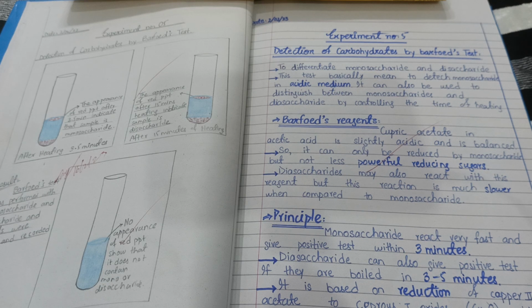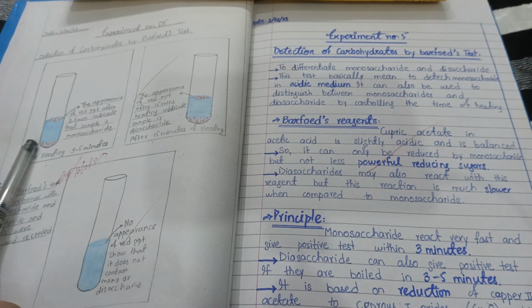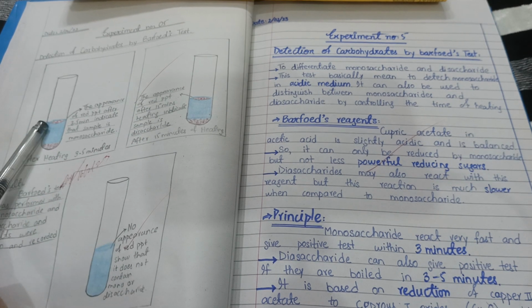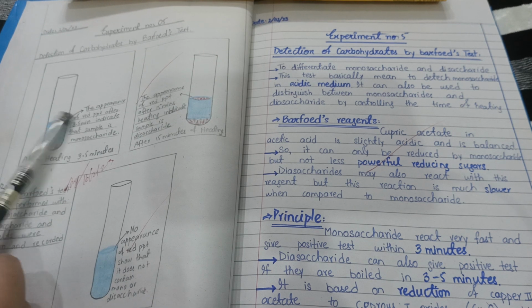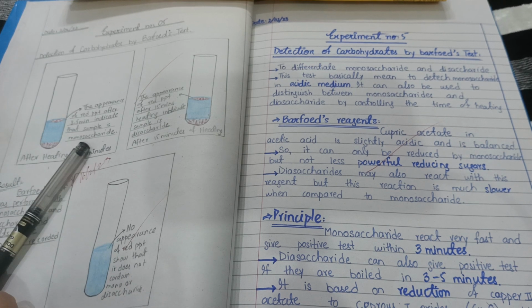So in the diagram you will see I have taken two test tubes. In the two test tubes you will see the red precipitate appear at the bottom as well as at the surface in both of these test tubes. So this red ppt appears after 3.5 minutes, so it means it is a monosaccharide.